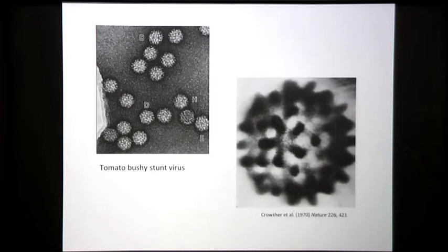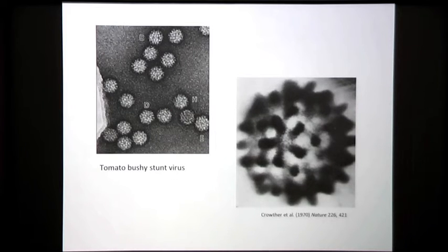We calculated 3-dimensional maps of negatively stained viruses at around 20 angstrom, which was nice then. It showed you what the molecular surface properties of the viruses were, and confirmed the architecture of the viruses in the way that had been hypothesized by Caspar and Klug for their quasi-equivalence theory for the structure of viruses. So that's basically where things stayed during the first half of the 70s. And what was needed was a different kind of preparation. This is fine, but all you're doing is imaging the stain coating the particles, so it limits you to looking at the surface details.